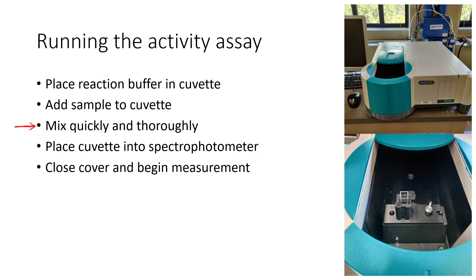You want to mix quickly so you can get that cuvette into the spectrophotometer as soon as possible to get an accurate reading for that initial velocity, because over time that reaction rate slows down and you might get a worse estimate of how much LDH you have if you wait too long. You also want to mix thoroughly — if you have uneven mixing you might get pockets in the cuvette where the reaction is happening faster or slower, and you might get air bubbles, all of which can make your reading more inaccurate.